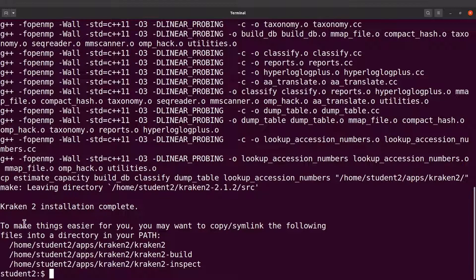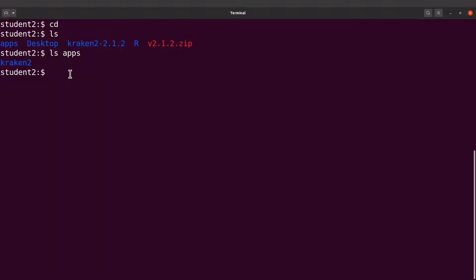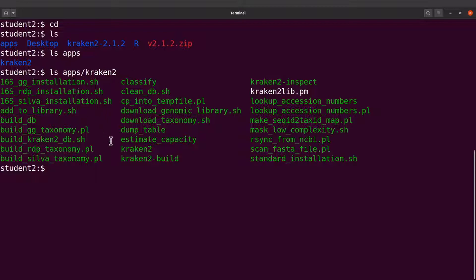The instructions say: to make things easier for you, you may want to copy or symlink the following files into a directory in your PATH. So we are going to add this directory to our PATH. Let's clear the screen, go back to the home directory, and do an LS into the apps directory. We'll see kraken2, and inside apps/kraken2 are the scripts that were generated and stored there — these are the scripts we use whenever we run Kraken.